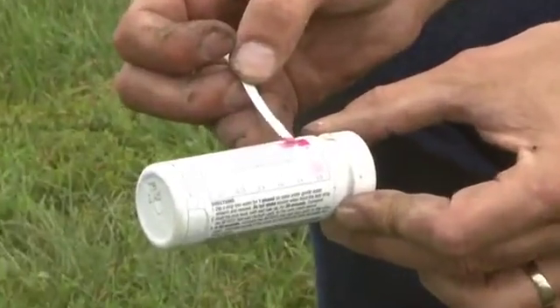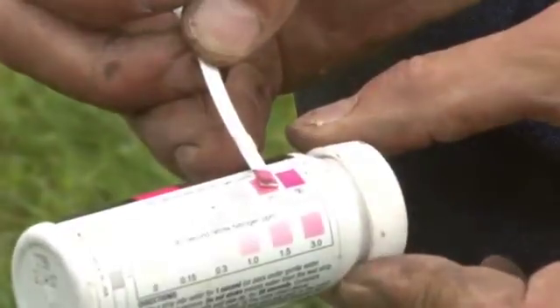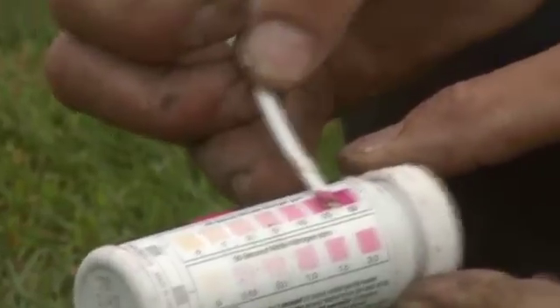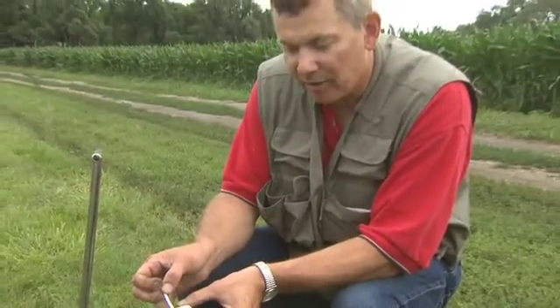In this case, we're between 20 and 50 parts — I estimated about 40 parts per million. And so this just provides an alternative test for our nitrate, nitrite, phosphate, and pH tests.